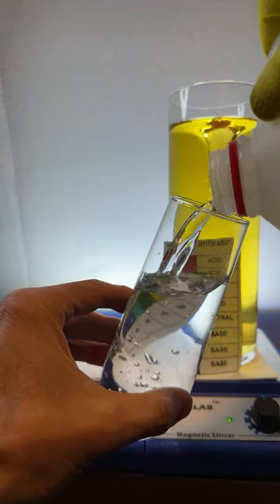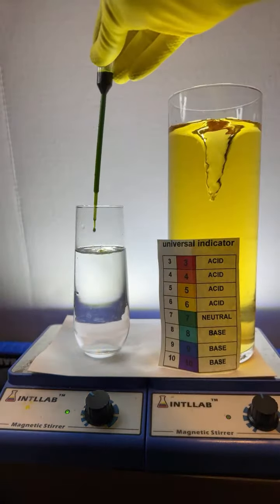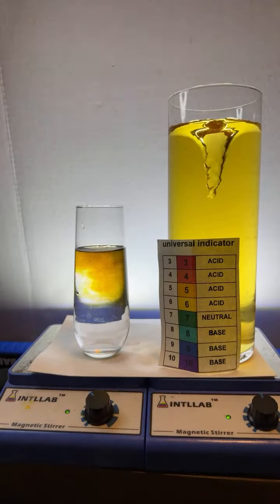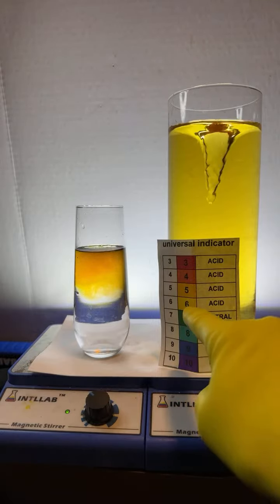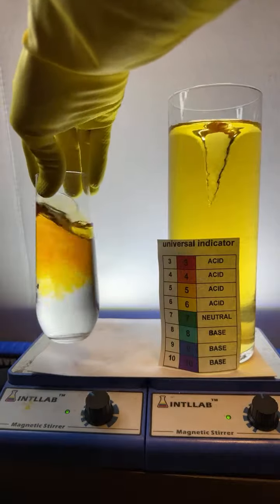And then we're going to add universal indicator to this. Give me a second here. Let's add some universal indicator. Where is it? All right, it's green. And when it goes into the water, it turns yellow. What's up with that, right? That was distilled water, which is purified water, and yet the pH isn't neutral. It's pH 6, which is slightly acidic. What the heck is going on with pure water being slightly acidic?